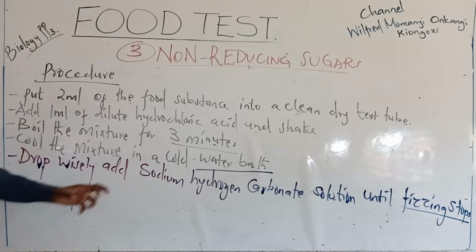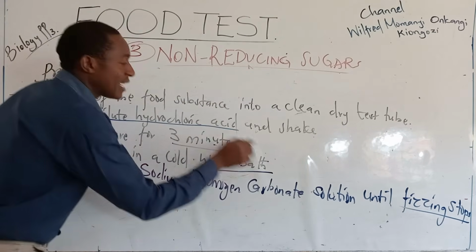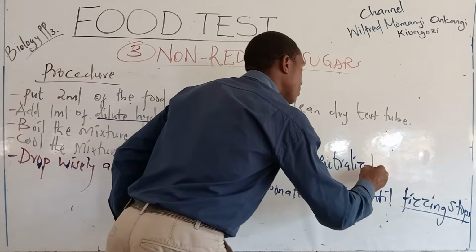What you are doing is sodium hydrogen carbonate is neutralizing the acid. This is a neutralization process.